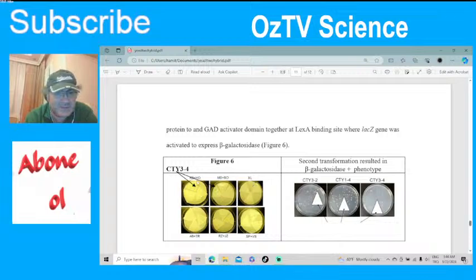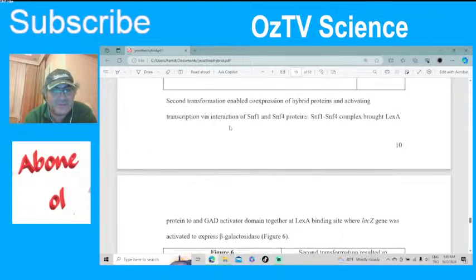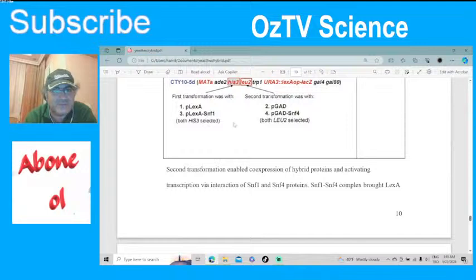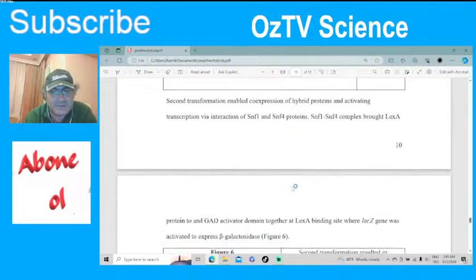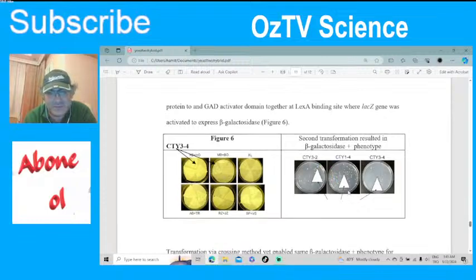And see, that's my initials, that is why, it was my friend, my sister and me. See, that was our plate. See, it changed color. You can see it was blue. See, plasmids 3 and 4. They just mentioned plasmids here, the 3 and 4. Second transformation results. Those are the results of the second transformation. 3 and 4, I guess.